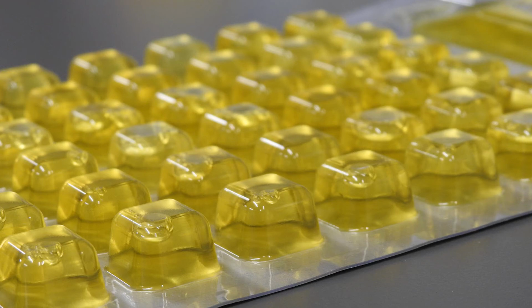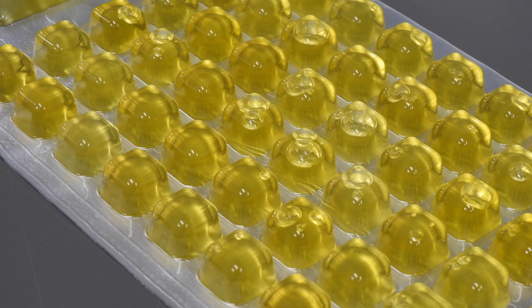Any cells within the tray that have turned yellow indicate the presence of total coliforms. Any cells that have turned a cyan color once they're passed under an ultraviolet light indicate the presence of E. coli. After we have those counts, we'll do some math and use those numbers to determine how much E. coli and total coliforms was present in the original sample.